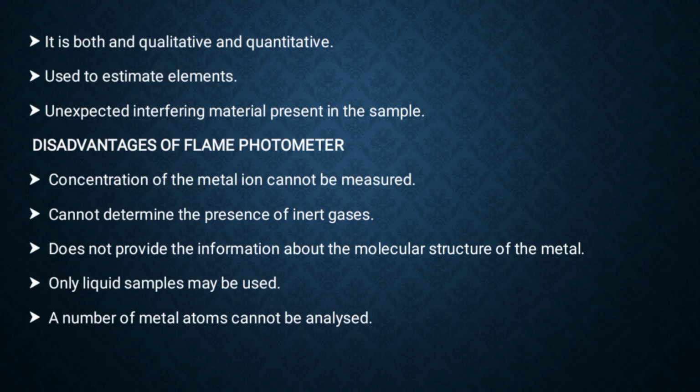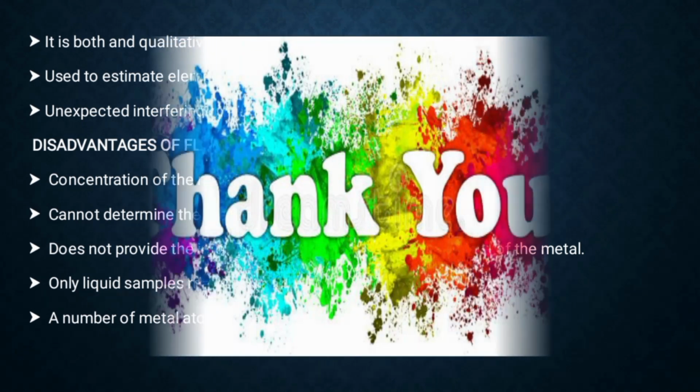This flame photometer cannot be used for the direct determination of the metal atom, which cannot be analyzed by this method. Elements such as carbon, hydrogen and halides cannot be detected due to their non radiating nature. Thank you.